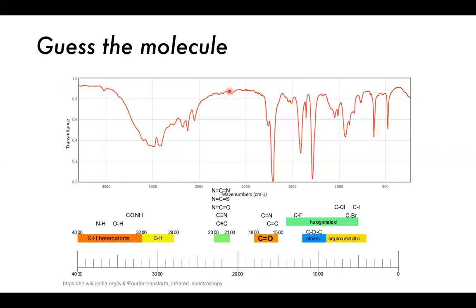I would not classify these as peaks, especially knowing that these peaks are all very strong from our table earlier, and me talking about the fact that things like nitriles had strong peaks, and these alkynes also had strong peaks. So in this region here, we would expect to see a very strong peak, probably similar to some of these peaks, if the structural moiety was present. For example, if we had a nitrile bond, a C triple bond N, we would expect to see a very strong peak here. We do not. So there's probably not going to be a C triple bond N or any of these others present in this spectrum.